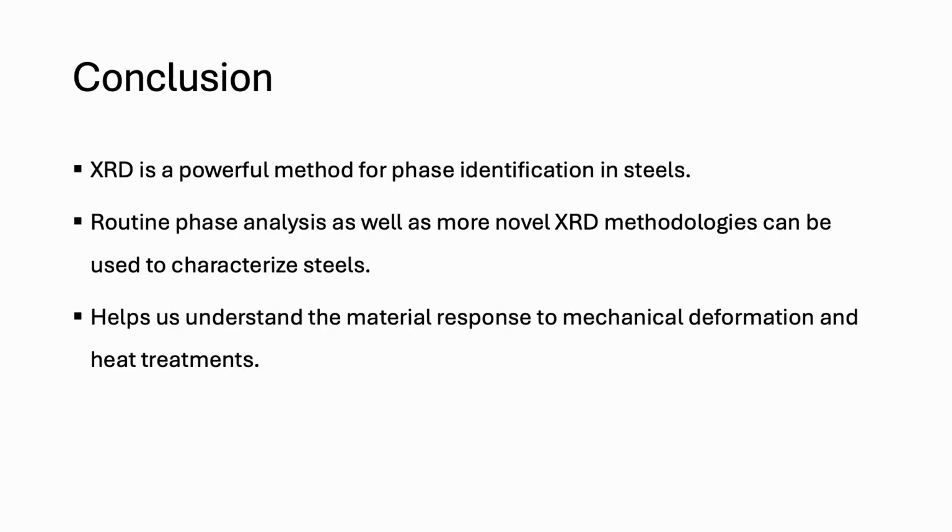And so in conclusion, we see that XRD is a powerful and versatile method for phase identification in steels. It can be used both for your routine phase analysis when you're using or making steel in any kind of engineering application, as well as to try some more novel XRD methodologies, including peak fitting, to characterize the steels. And overall, it helps us to understand the material response to mechanical deformation and heat treatments, and therefore allows us to more accurately quantify both the phases and the properties of the steel.